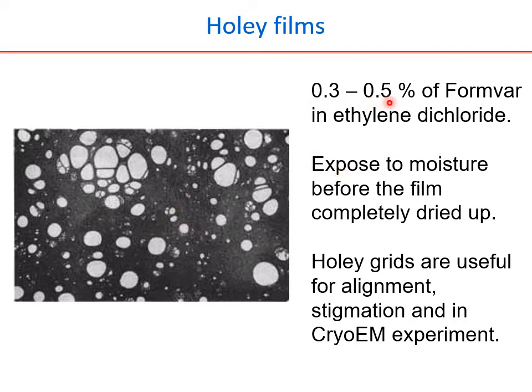Now the exposure to the moisture is a little tricky thing. For the moisture, they suggest going for a humidifier. The commercial people are always trying to exploit money from us, but this can be just set up in the laboratory itself. What can be done is to take a kettle and use an optimal temperature so that the water will come out as slow fumes. This requires some experience and some trial and error to see what the flow rate of the fumes, the water vapors coming from the kettle, should be.